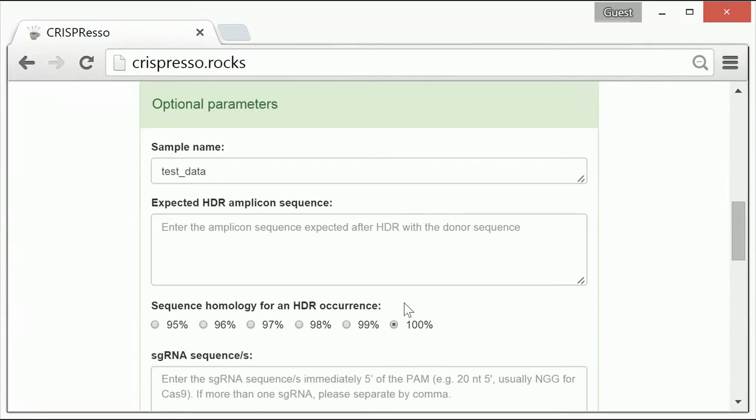Therefore, if you have a read that exhibits successful HDR but has a SNP or sequencing error within the amplicon, you can lower the sequence homology setting in order to allow CRISPResso to count the read as a successful HDR event.